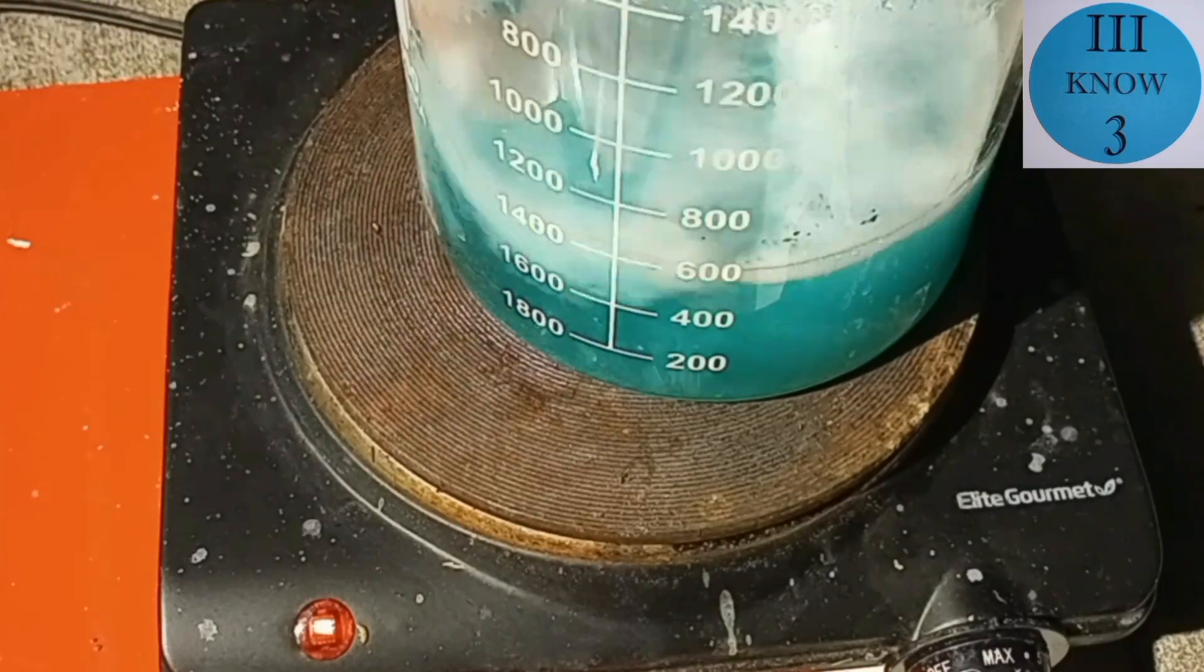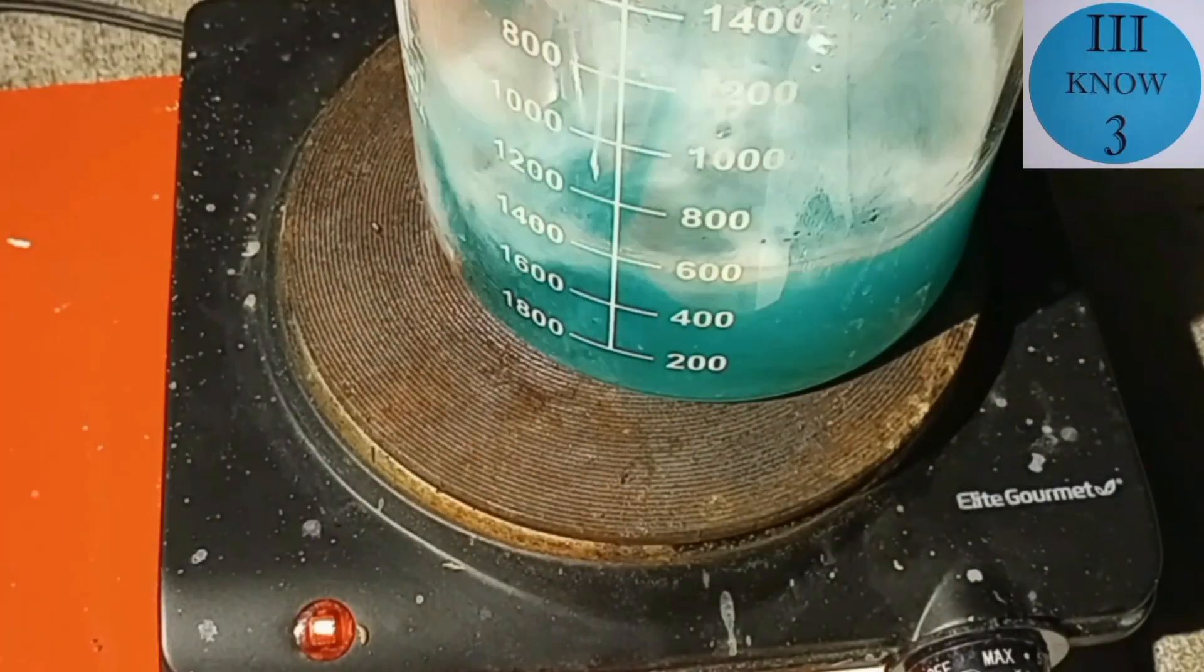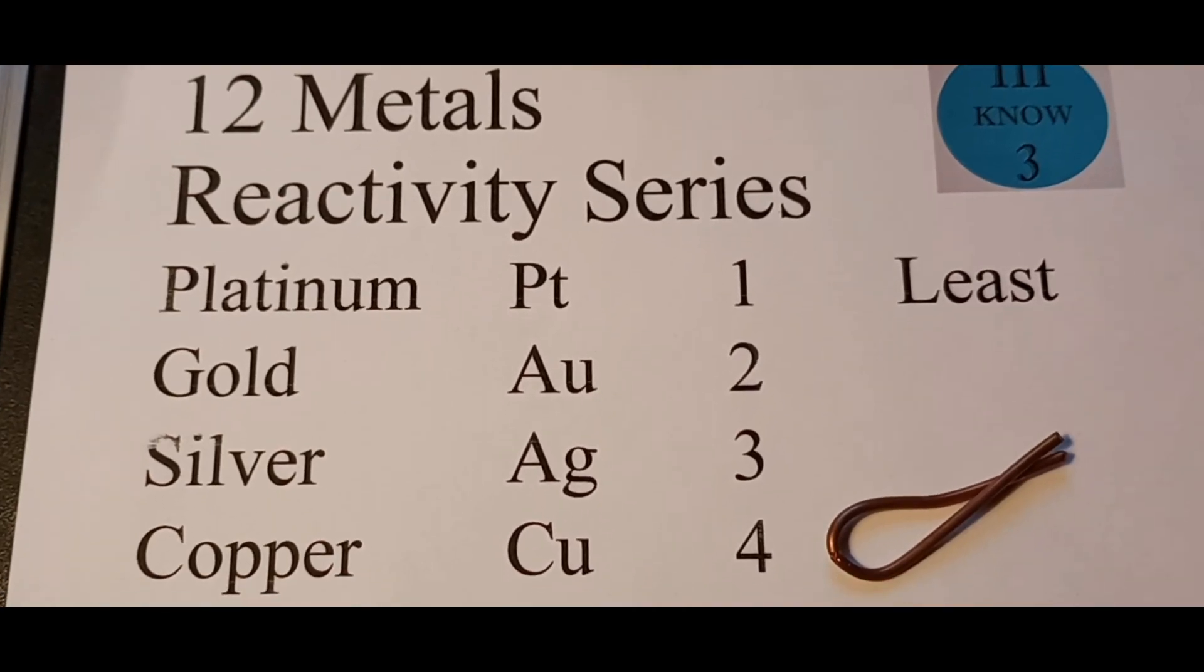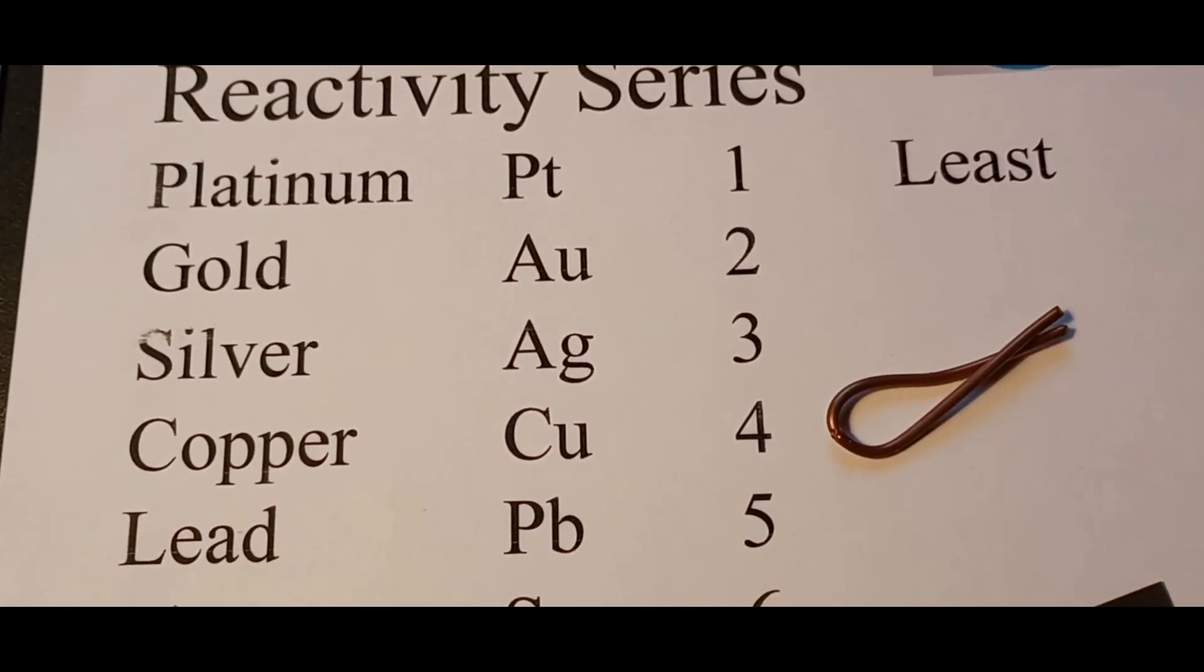And now we're going to add a larger piece of zinc that weighs 10 grams by itself. If you watched my brass copper zinc and acid series you may remember I made a reactivity series list of 12 metals from the least to the most.